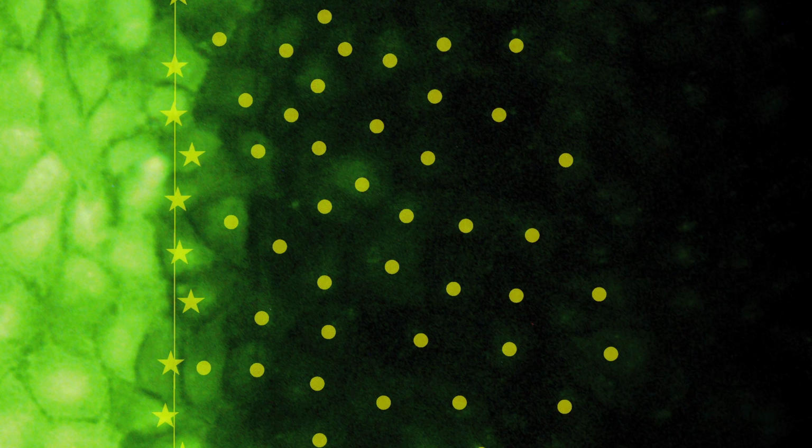A quantitative measure of how much gap junctional transfer has occurred can be done manually by working with the fluorescent and phase contrast images of electroporated cells. The stars along the edge of the conductive area are considered donor cells. They have been electroporated and taken up lucifer yellow. They pass lucifer yellow to neighboring cells to the right, which pass it on still further in diminishing amounts.